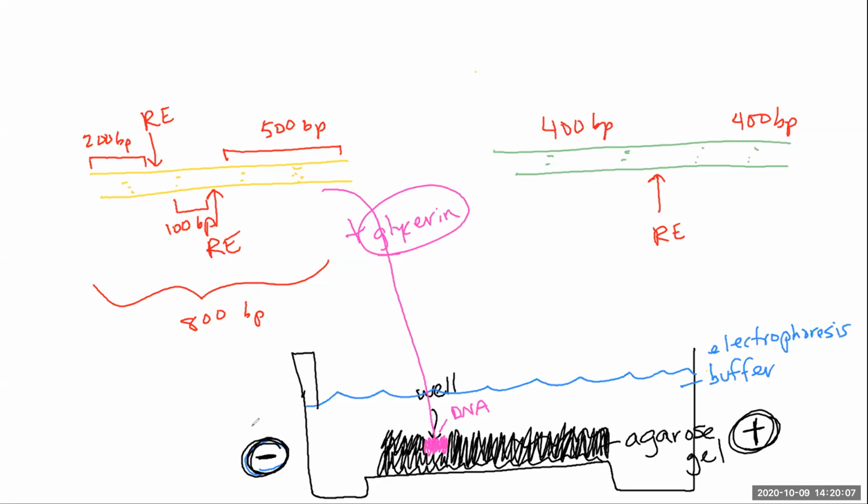Here's my terminal, and I'm going to hook it up to an electrode. There's a circuit with a plug that connects to this. The negative charge is going to go in here, and negative charges are going to be attracted to the positive that's hooked up to the other side.